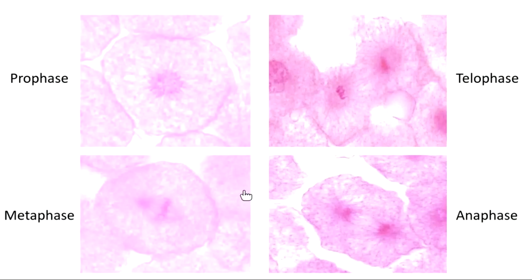Then I transition over here into anaphase. In anaphase, I see two different sections of my genetic information. It's being pulled toward a centriole right here, and it's being pulled toward a centriole right here. The difference between anaphase, where my chromosomes are being pulled to opposite sides, and telophase comes down to that thing we were just talking about, right? That cleavage furrow.